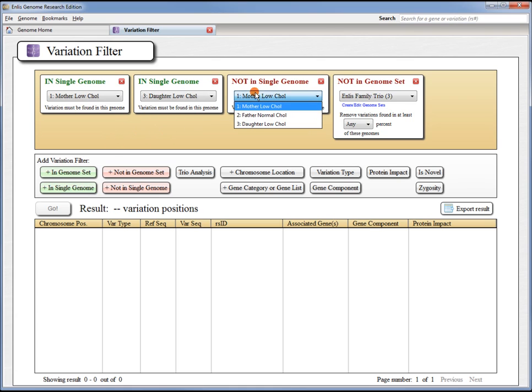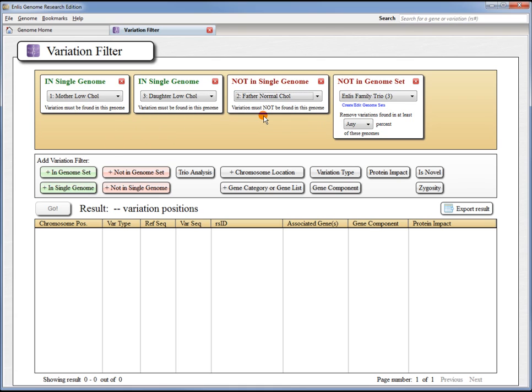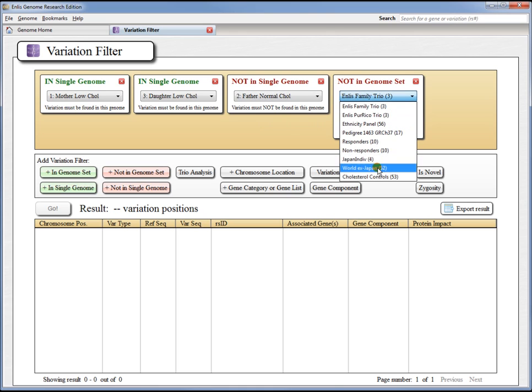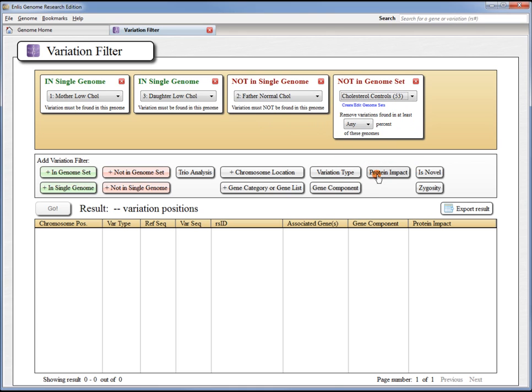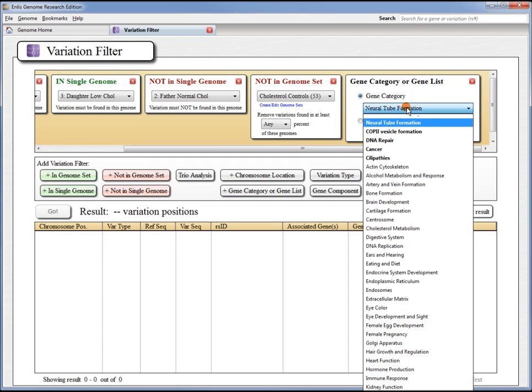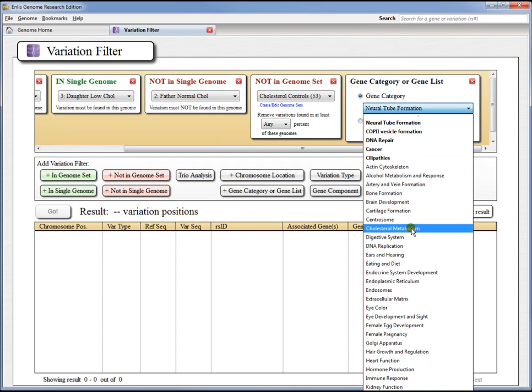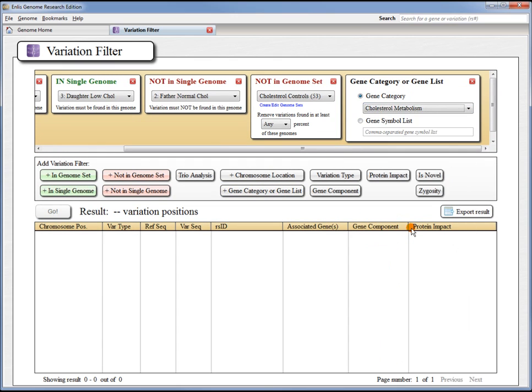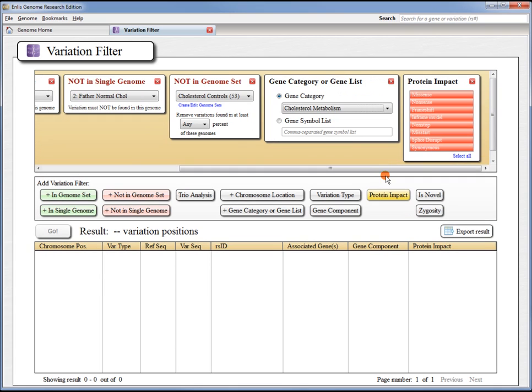We know we want to search in the mother's genome and in the daughter's genome for a variation they share. And we know we want the variation not to be found in the father's genome and not to be found in the set of 53 control genomes. We might add a gene category because we know this is involved in cholesterol metabolism. The software contains a number of predefined categories, or you can create your own. We might also want to try first looking for a variation that has a non-synonymous protein impact. We'll add that filter, and once we're done we can go in and press the Go button.